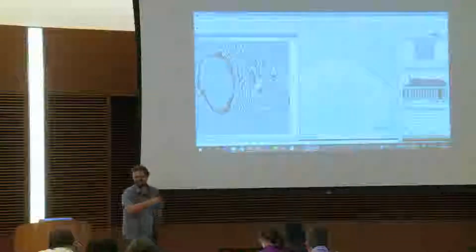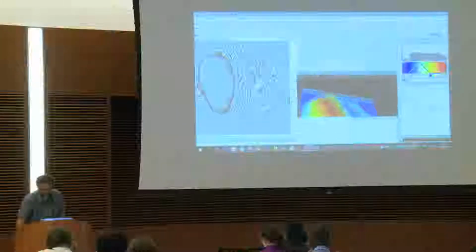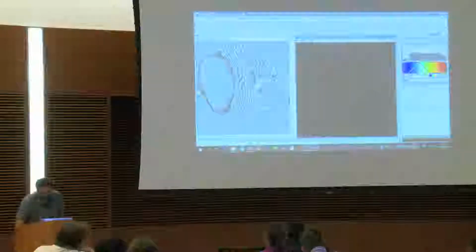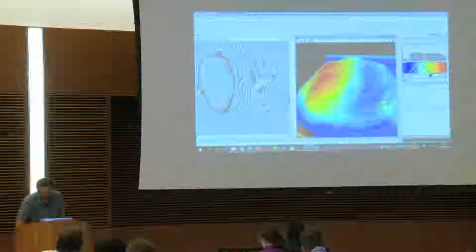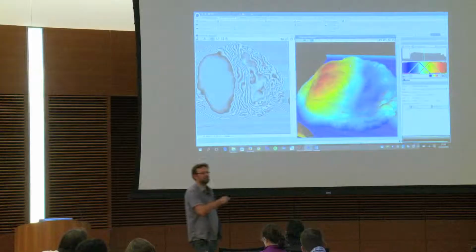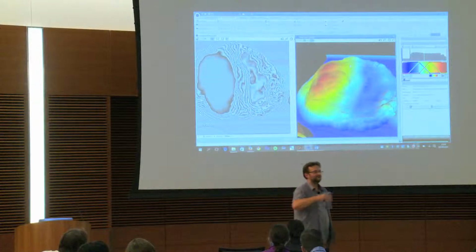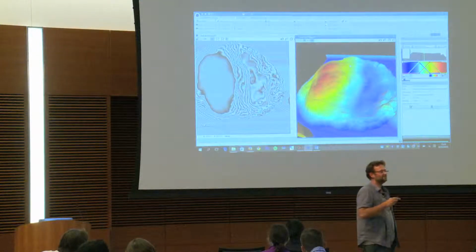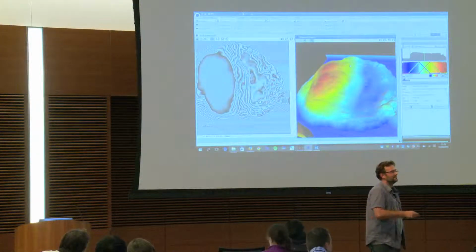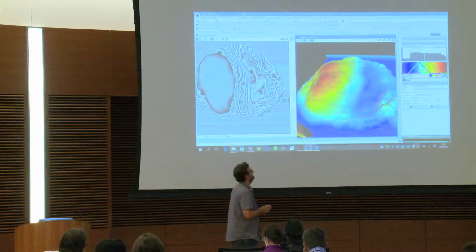But you know everything. So he's saying, you say that it is everywhere, and you are absolutely right. And here you can really see it in 3D, because the stripes here are visible thanks to the shading of the rendering. Okay, so you have those stripes, meaning that the noise is everywhere. Auxiliary question for you. Do you believe that there is a noise between this position and the very next one? Yeah, of course, but this time I can't tell. I cannot measure it, and I don't have a model for it.